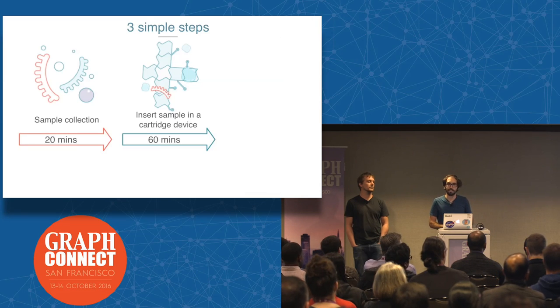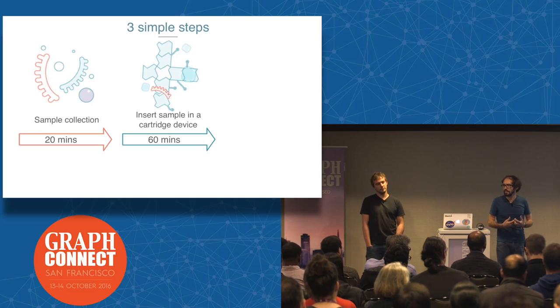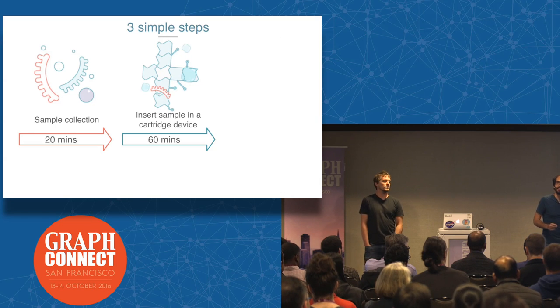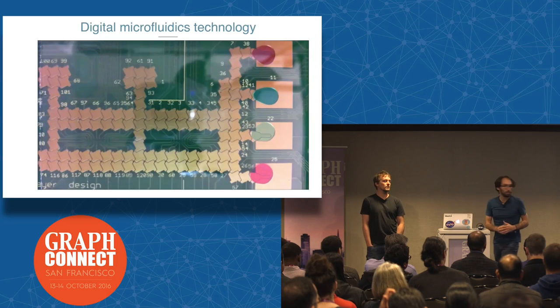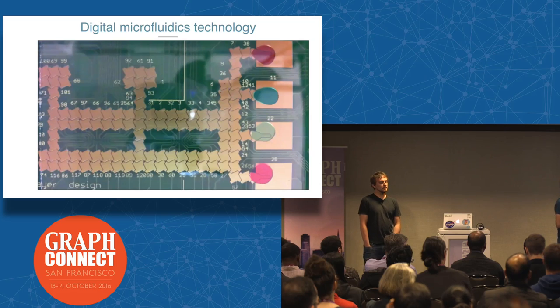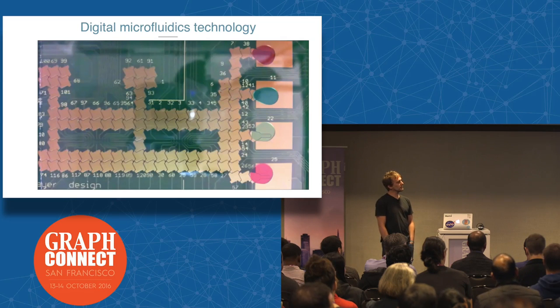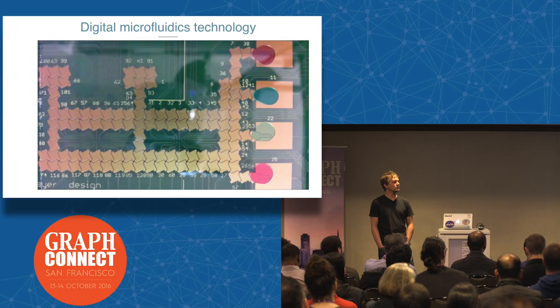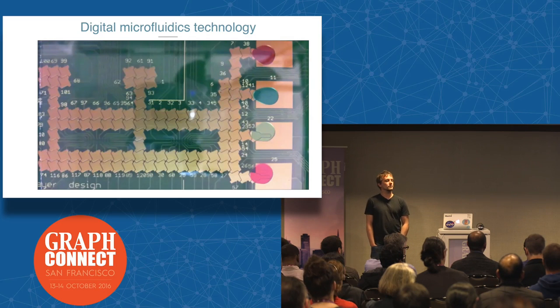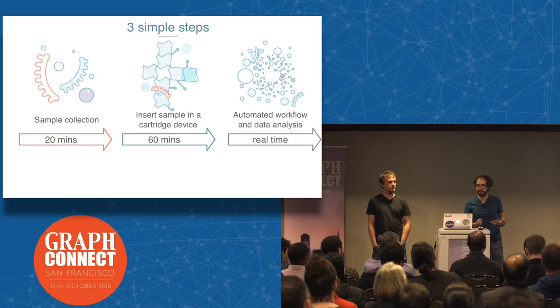The second thing we did to fix the need of highly skilled scientists is a platform based on a technology called digital microfluidics, which is basically you have a cartridge like this one. So this is a PCB board, it's like the size of your phone. And basically what it has, what you see here in yellow, is electrodes, just an array of electrodes. When you put that cartridge inside an instrument, it applies voltage to a specific electrode. You have the PCB, and you have a plastic cover. That plastic cover is connected to ground. And that microspace between the PCB and the plastic is sandwiching the droplet, the sample, and the reagents. When you apply potential, it creates a capacitance force that can make the droplets and the reaction move.